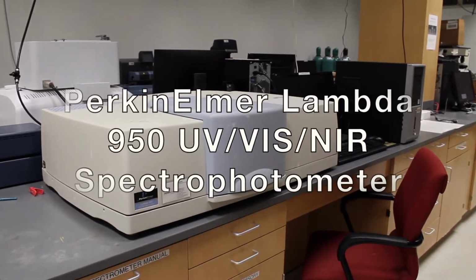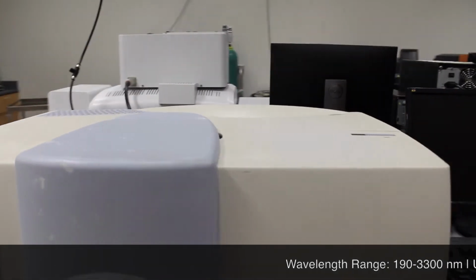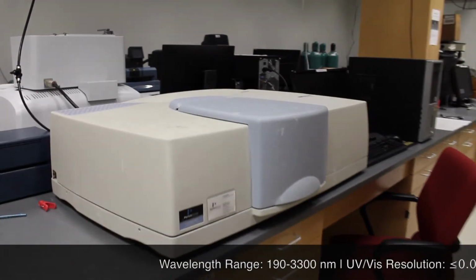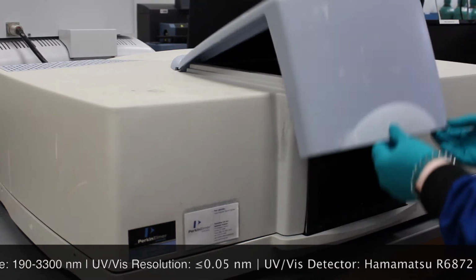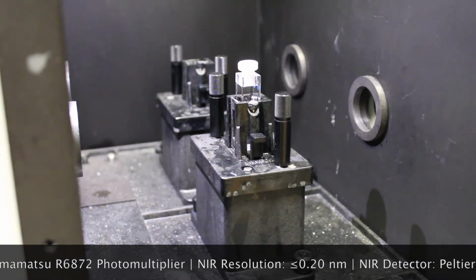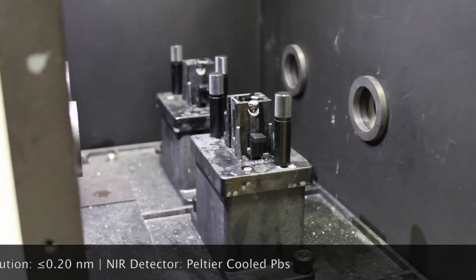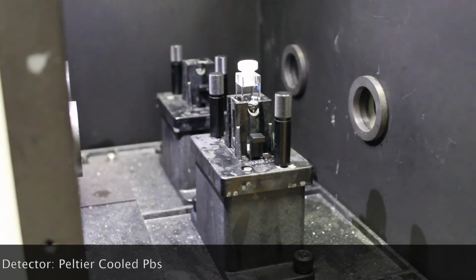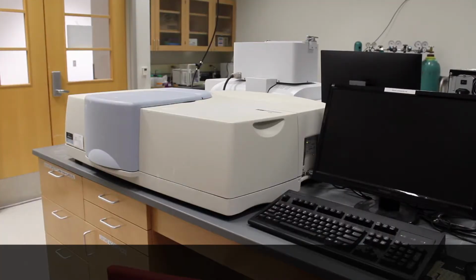Our ultraviolet, visible, and near-IR spectrophotometer is used to study the absorbance of materials spanning the electromagnetic spectrum, ultraviolet to near-infrared. This is a wavelength scanning double-beam instrument, and it uses a deuterium or tungsten halogen light source to span the ultraviolet, visible, and near-infrared spectral range. It has two detectors, a photomultiplier for ultraviolet and visible measurements, and a cooled lead sulfide detector for the near-infrared measurements. The instrument can be used to measure liquid, solid, and thin film samples. In addition to standard absorbance measurements, a universal reflectance accessory is available to enable high-precision, absolute reflectance measurements.